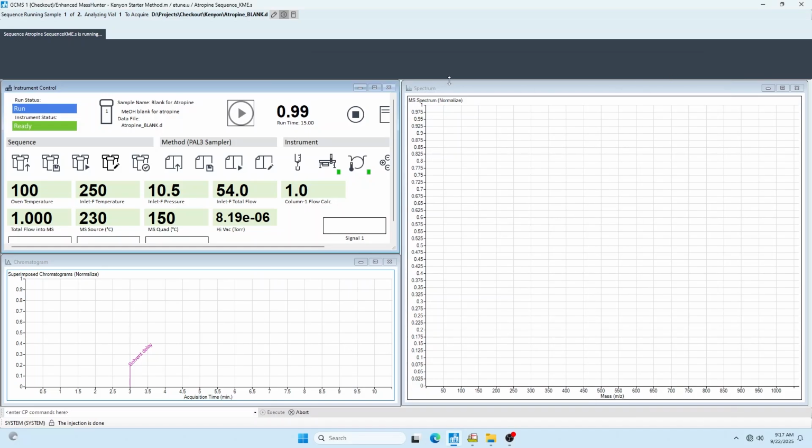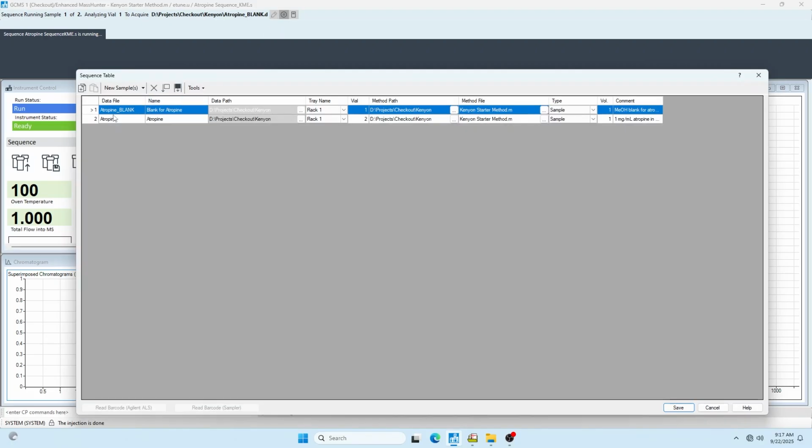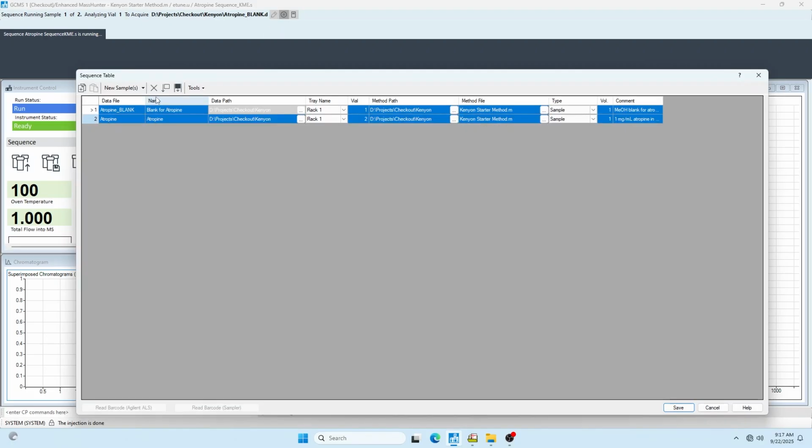So when you come upon the instrument and it's already running a sequence, you can actually append the current sequence and save that. So we can see the instrument up here is already running. Over here, there are 3 little buttons while it's running, and you're going to click on the pencil one. You're going to do this all very carefully to avoid messing up people's stuff. But you can do like you did when you were doing your own sequence and add new samples.